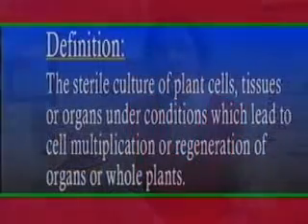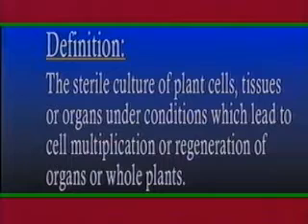To start with, let us look at the definition of plant tissue culture, or as is also known, the in vitro culture. It is the sterile culture of plant cells, tissues, or organs under conditions which lead to cell multiplication or regeneration of organs or whole plants.